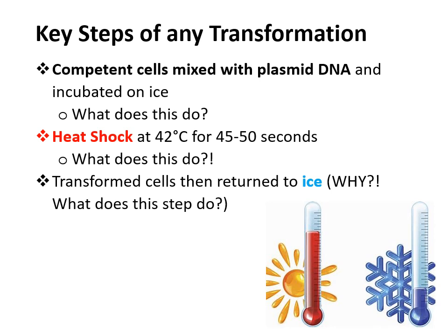You would then mix some of those competent cells with plasmid DNA. In our case, what's the plasmid? It's pea blue. So you would mix the competent cells with the plasmid DNA because now you want that plasmid DNA to coat or stick to the outside of those competent cells. Again, sticking to the outside of the cells because those cells are currently coated in positively charged calcium.